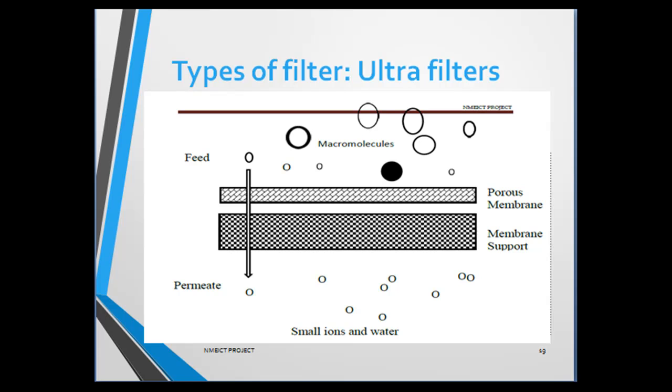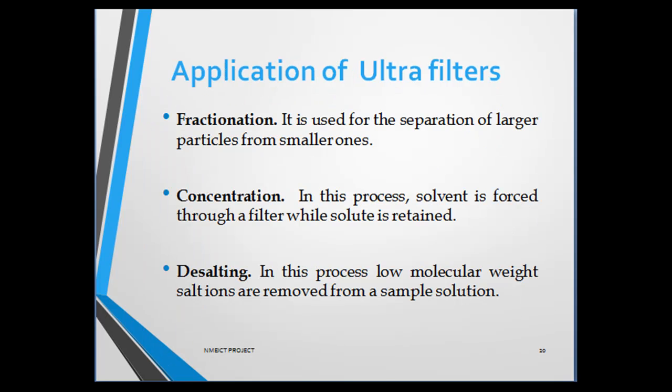The applications of ultrafiltration can be classified as fractionation, concentration, or desalting. Fractionation is used for the separation of larger particles from smaller ones. For example, proteins that are significantly different in size can be separated from one another by ultrafiltration.